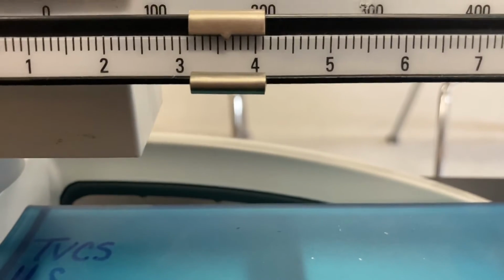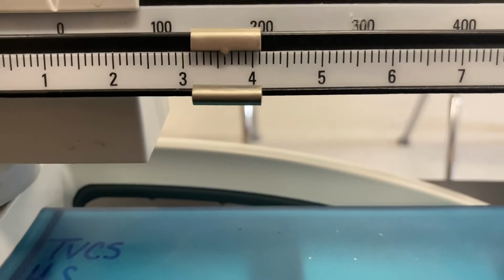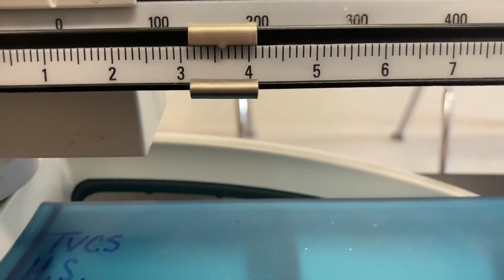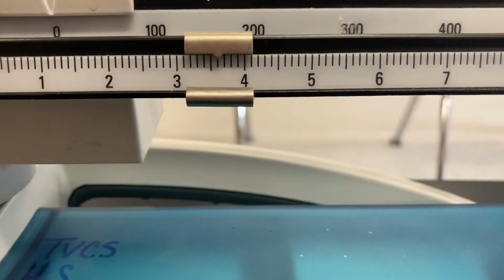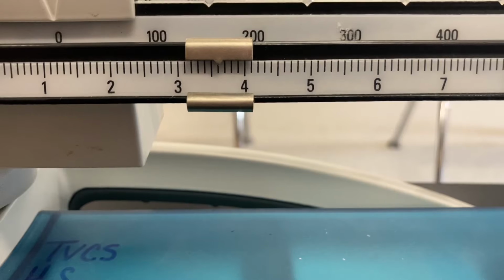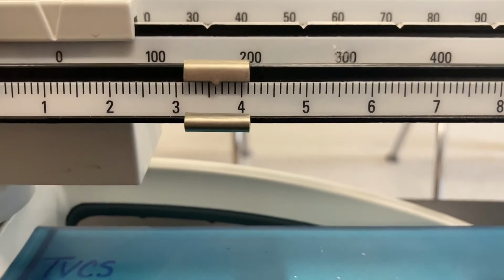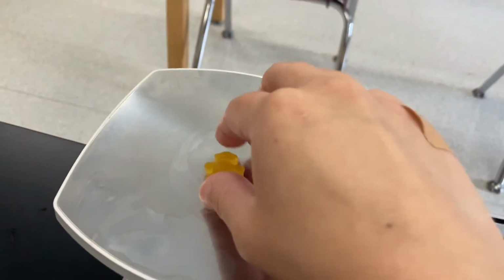So go ahead and see if you can determine the mass in grams of the gummy bear. That's what it looks like here. Go ahead and pause the video. It looks to me like it's about 3.6 grams. All right, so we're going to take our gummy bear and go back over here.